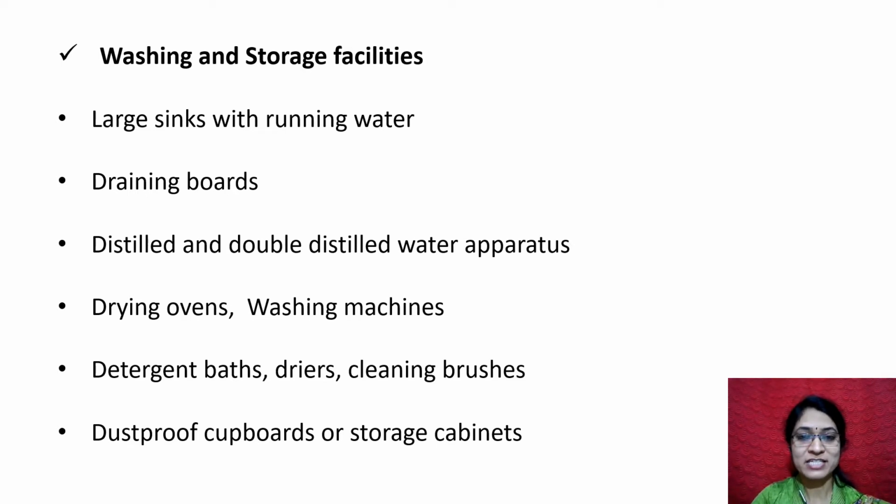A tissue culture facility requires continuous running cold and hot water, and drainage of disposal water is a must. Disposal of any waste is governed by local municipal codes and international norms to minimize health risks and environmental hazards. Cleanliness must be maintained in the laboratory setup.